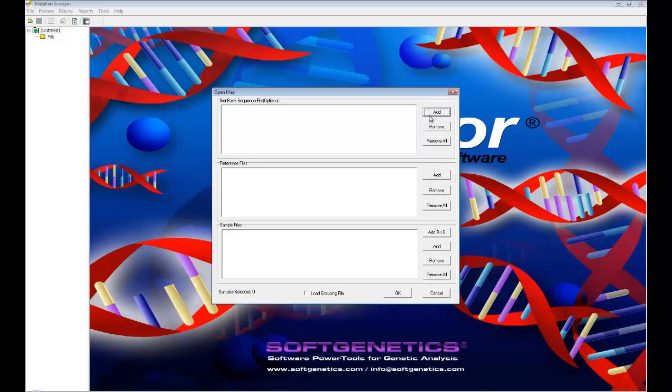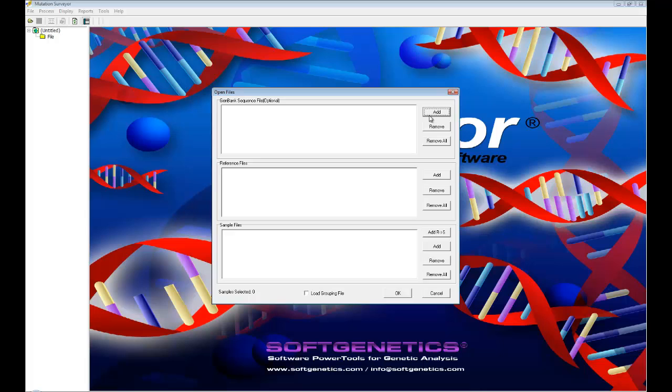We will begin the webinar by loading mitochondrial sequence files into the program. The process of analyzing mitochondrial sequence files is the same as using nuclear sequence files. The only difference is that you must load a mitochondrial GenBank file into the GenBank pane.